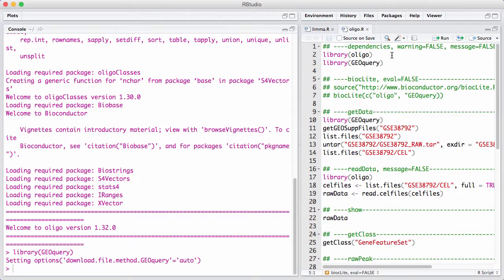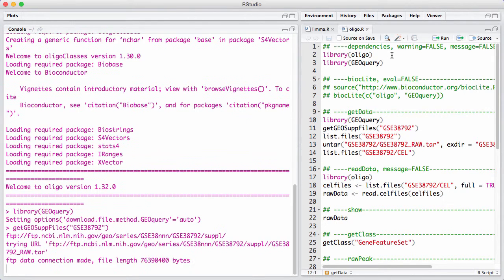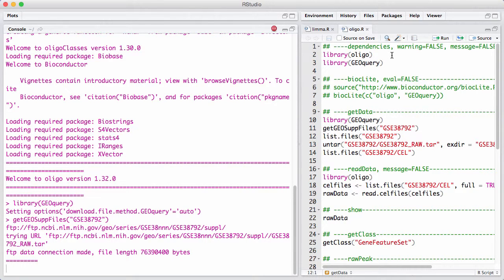For Affymetrix microarrays, raw data is stored in a typically binary format called CEL. These are not the standard files you get from GEO. These are always submitted as supplementary files from GEO. The way we get these CEL files is we know what the accession number of the experiment is, and then we get the supplementary files. Let's run this one here. It's going to take a little while, because there's a fair amount of data.